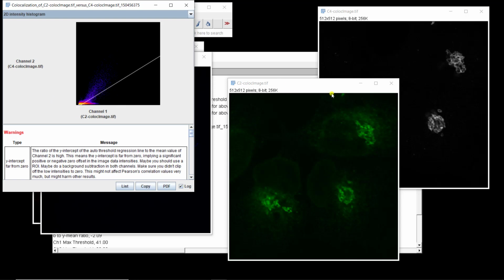And it makes sense because if you look at this region, for example, it's not very high intensity, but it's definitely not black in this channel. And here it's definitely in the background. And finally, you have this region that corresponds to pixels that have a high intensity in both channels. So basically, if you see something like this, it means that you probably have colocalization.